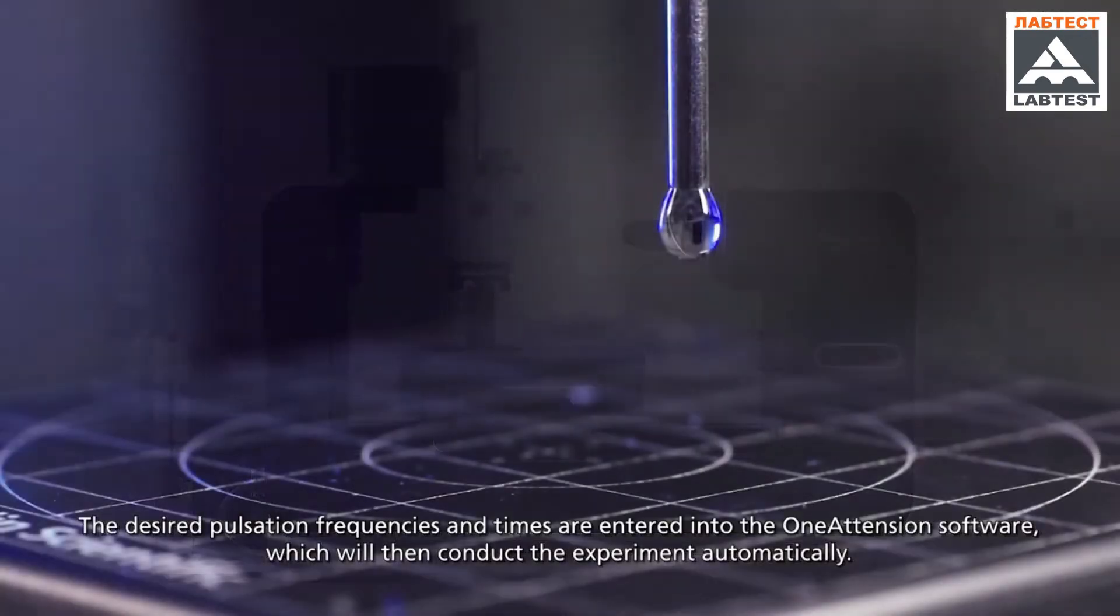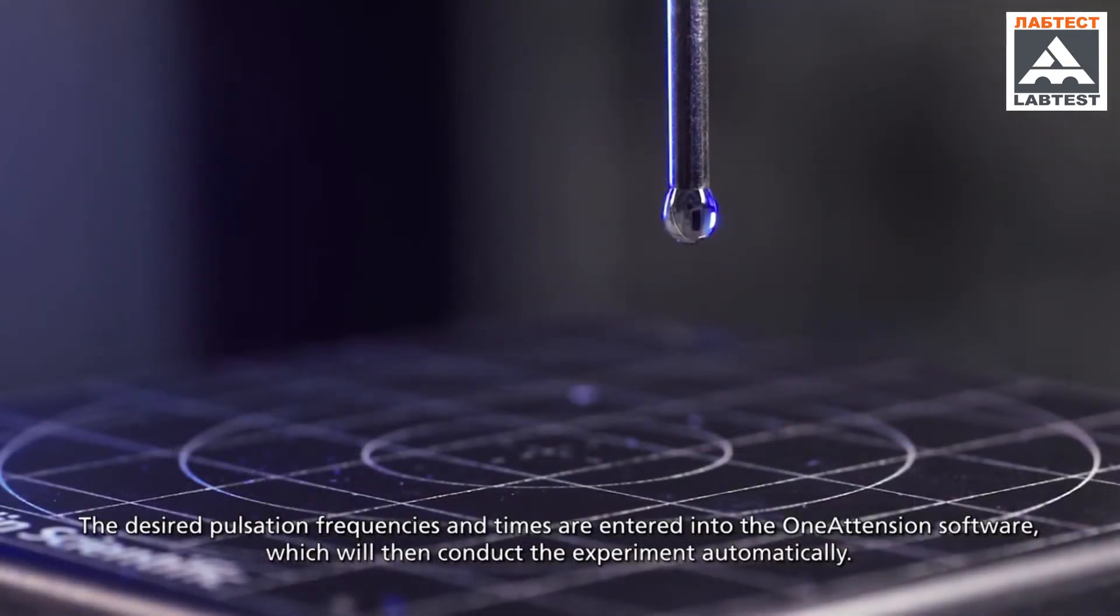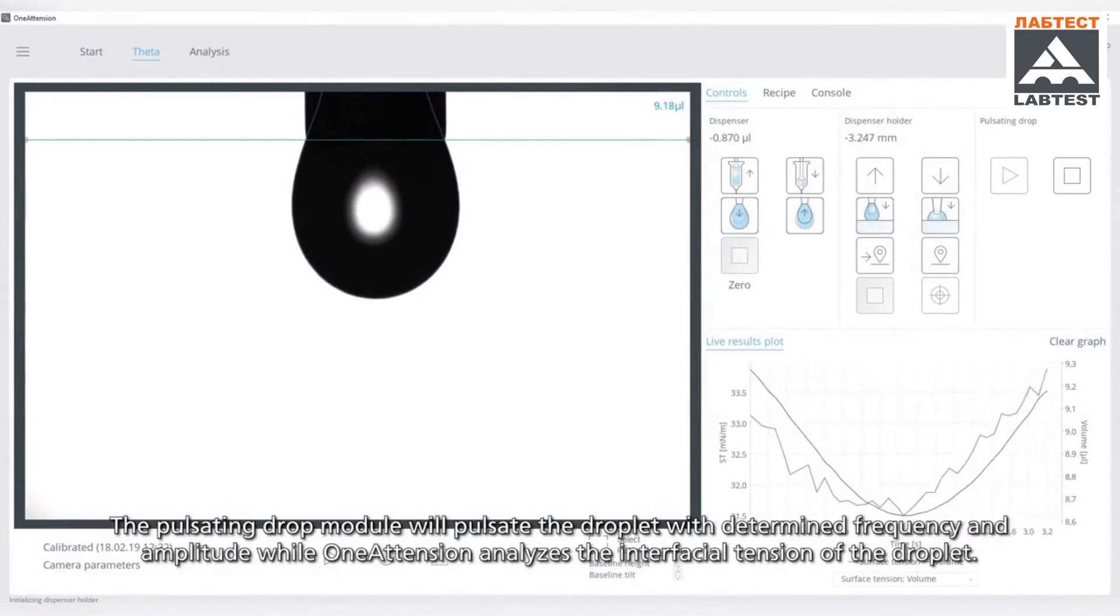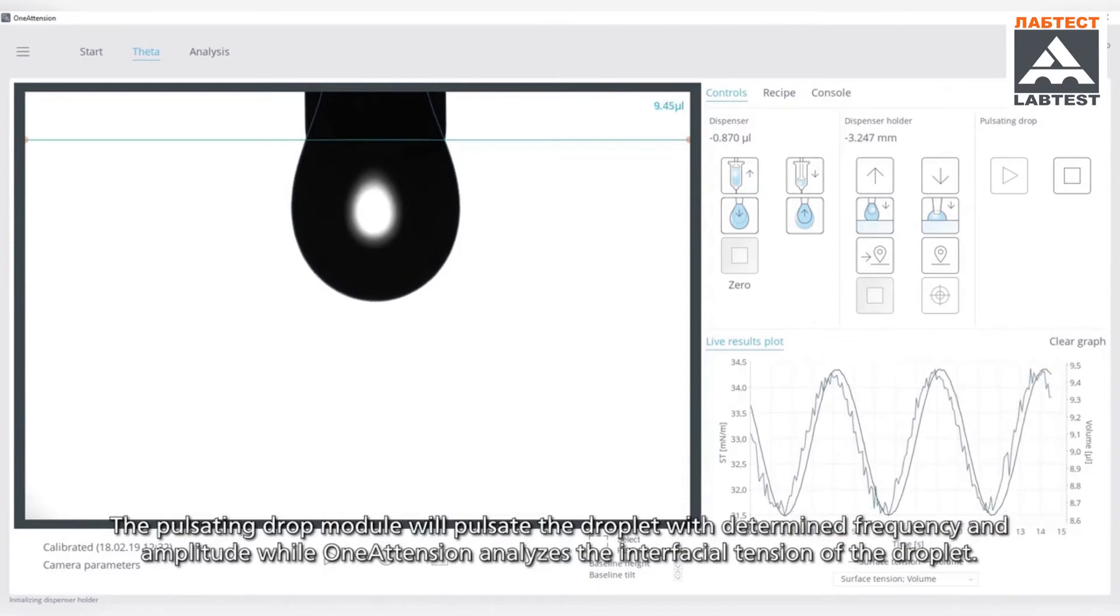The desired pulsation frequencies and times are entered into the OneAttension software, which will then conduct the experiment automatically. The pulsating drop module will pulsate the droplet with determined frequency and amplitude, while OneAttension analyzes the interfacial tension of the droplet.